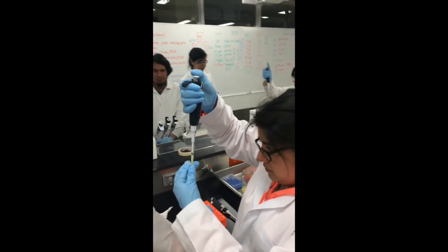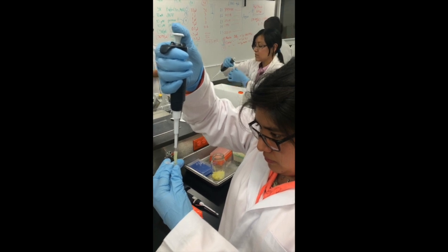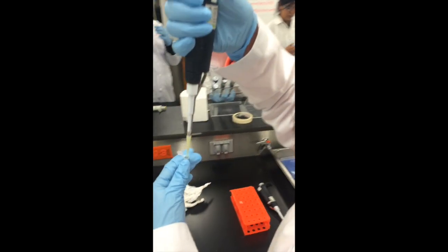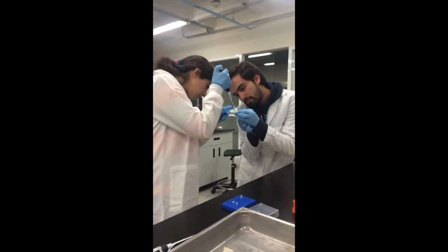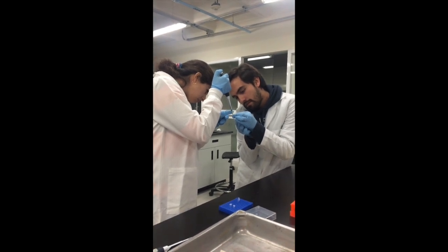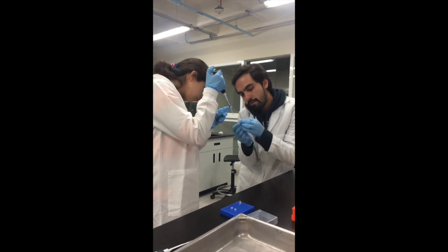About the results obtained in this practice, the most significant would be the fact that the DNA sample is not observed on lane 2. We attribute this to the fact that during DNA preparation, the sample was quite diluted with water, and maybe that's why there is no PCR product. It is remarkable that, as expected, on lane 3 there is no sign of DNA contamination, therefore it can be assumed that the protocol was successfully followed.